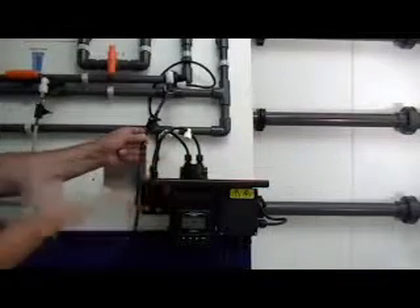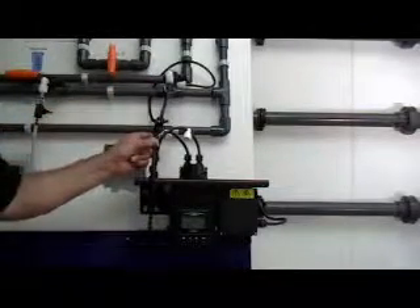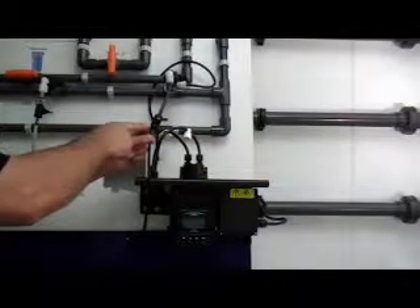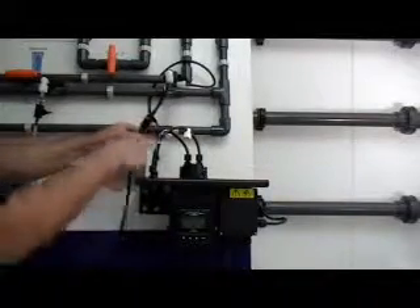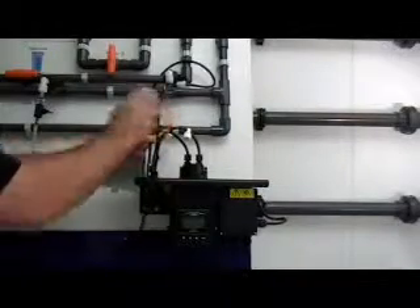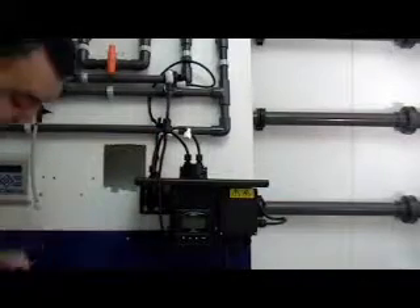Now that the 4150 is mounted to the wall, it is important to install the turbidimeter as close to the sample point as possible to ensure a quick response to changes in turbidimeter levels. Also, we recommend that a separate isolation valve be purchased and installed prior to the regulator. This will allow the operators to shut off the flow stream if there are any problems with the pressure regulator, measuring cell, or the tubes that connect the turbidimeter to the sample point or drain.